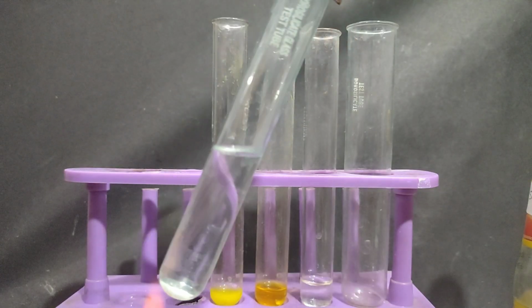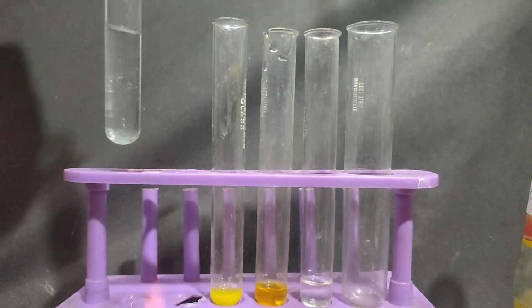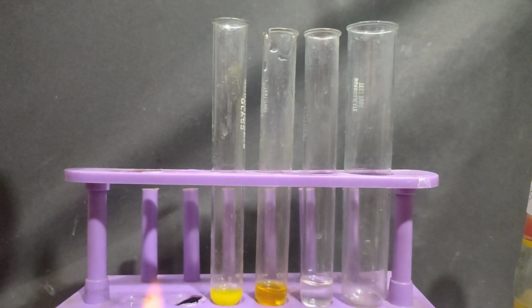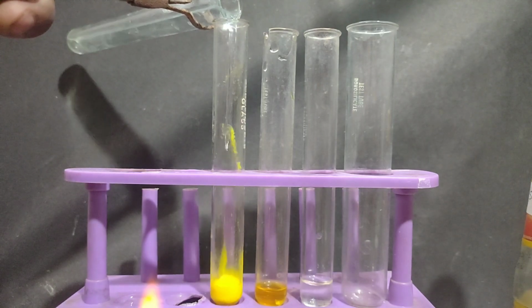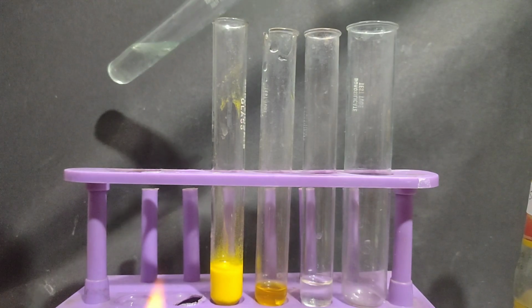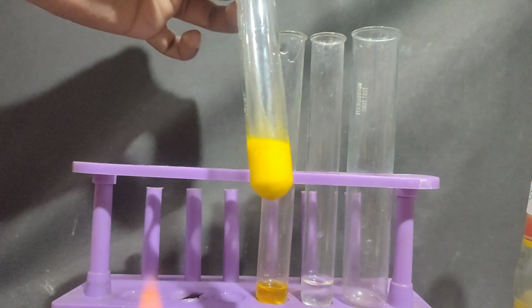I'll be heating this to dissolve this precipitate. Once our precipitate is dissolved, I'll be adding this solution into each of these test tubes. First I'll be adding to potassium iodide solution, and you can see the observation of a golden yellow color. It is actually a golden yellow precipitate of lead iodide.